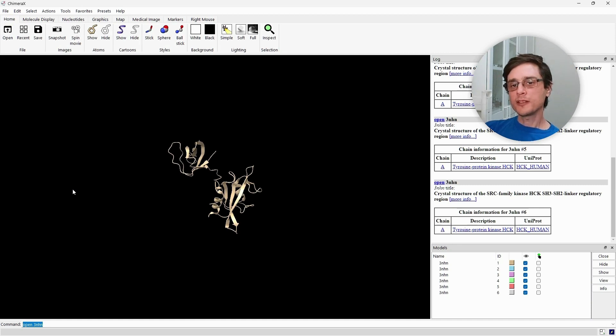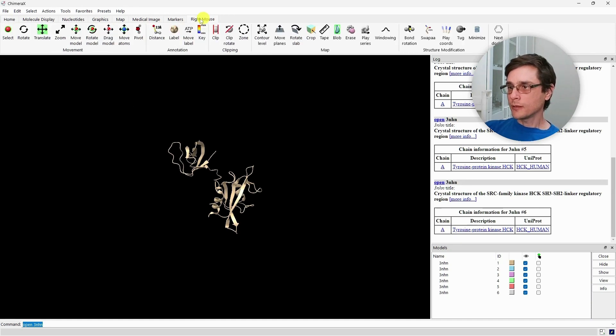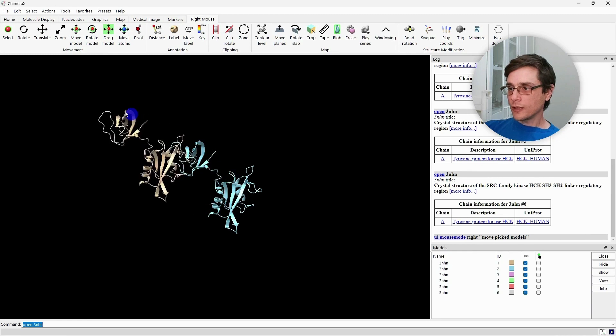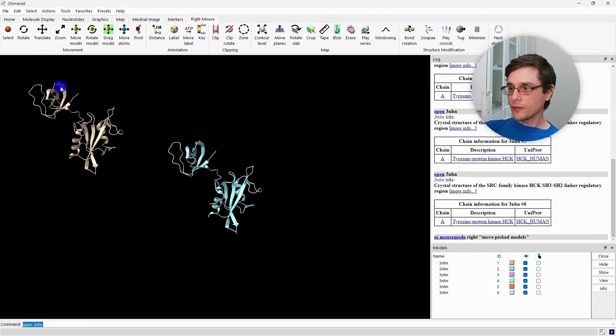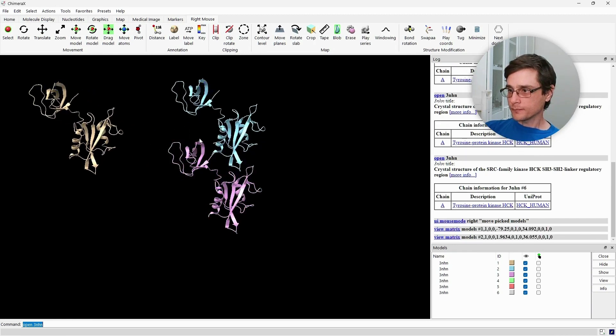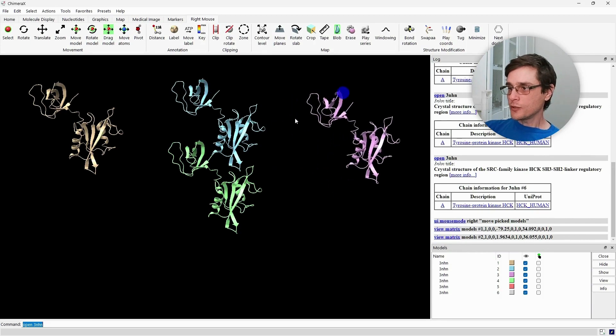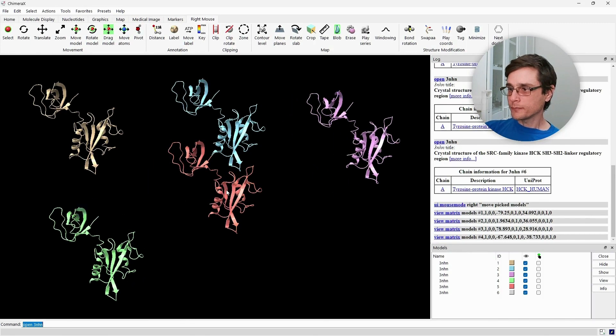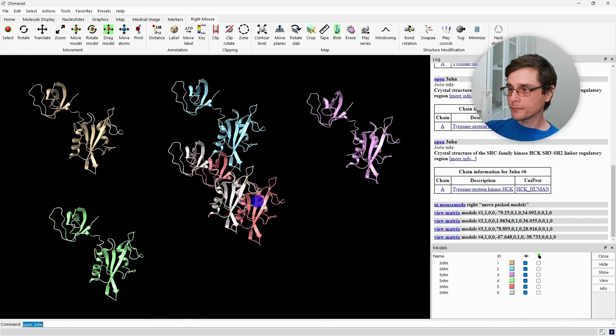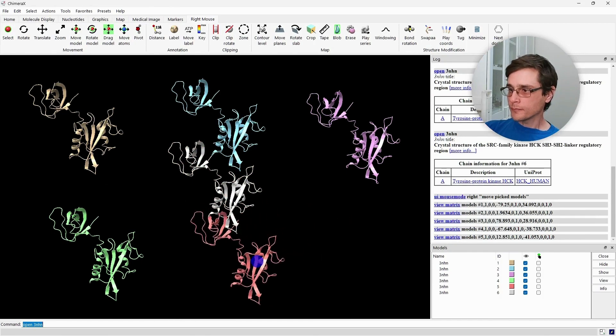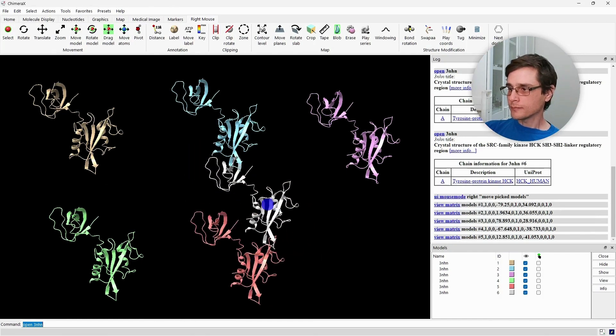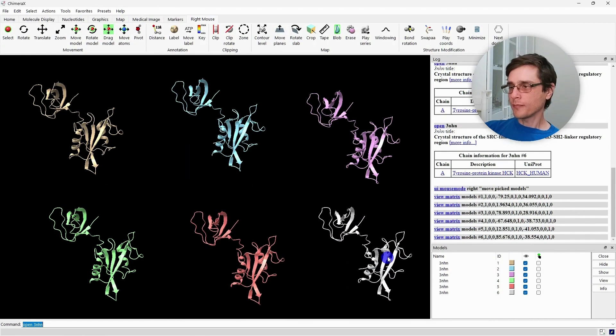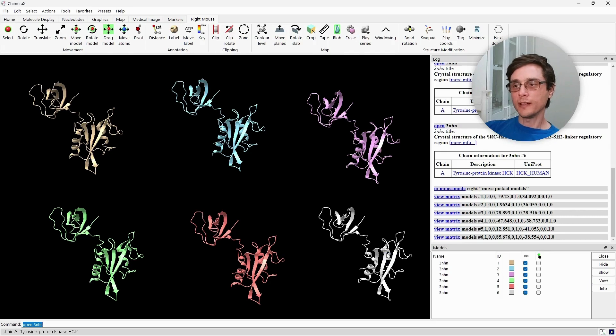Now, to make our lives a bit easier, we'll go to the right mouse section and choose Drag Model. Now we can use the right mouse button to drag the models to different places on the canvas. We'll arrange the six models so they don't overlap. And now, let's get to styling them.